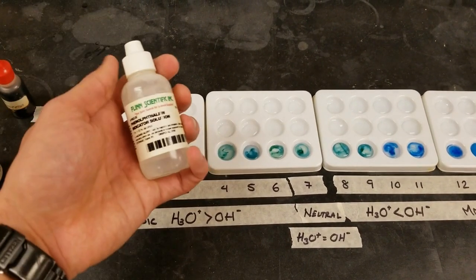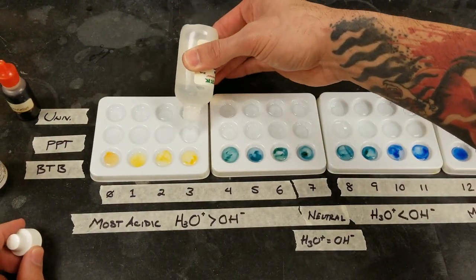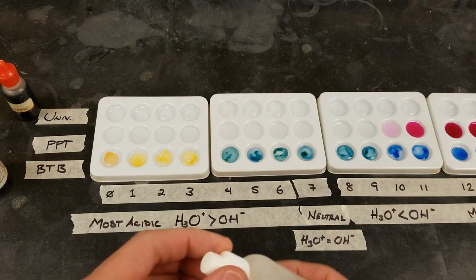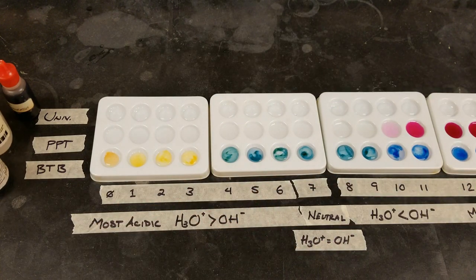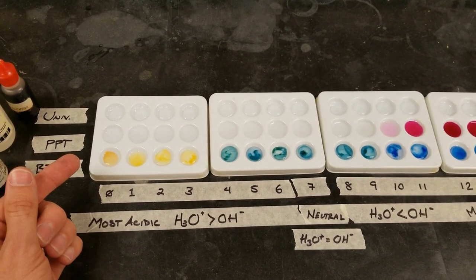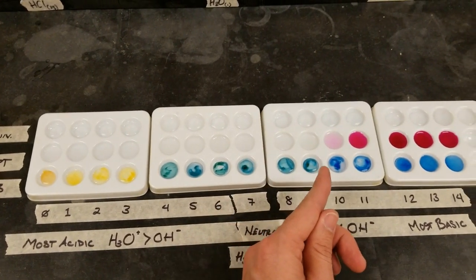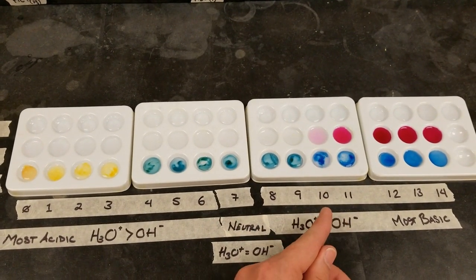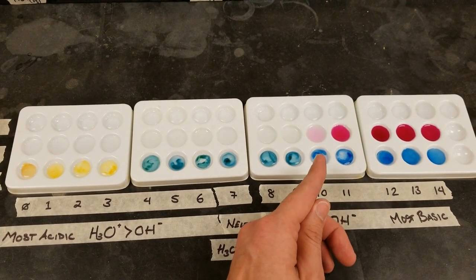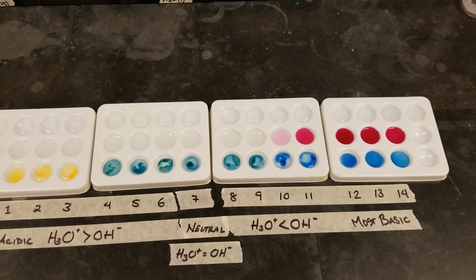Next is phenolphthalein. You can see it doesn't cause any change in acidic solutions or neutral, and right around this amount of hydroxide it starts to turn light pink and then deep pink for the most basic solutions.